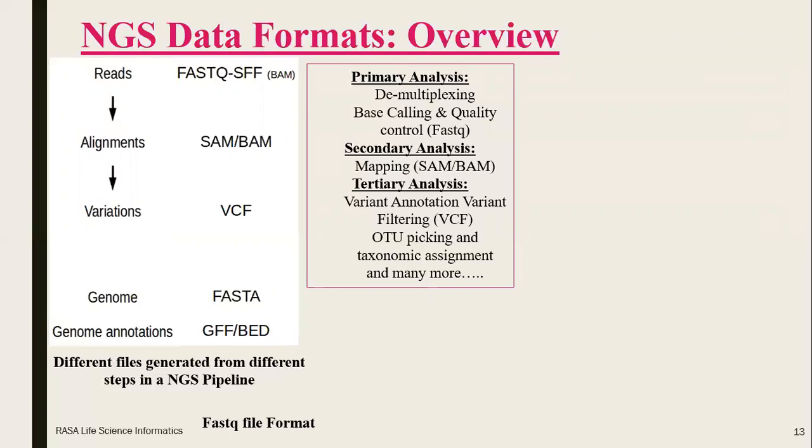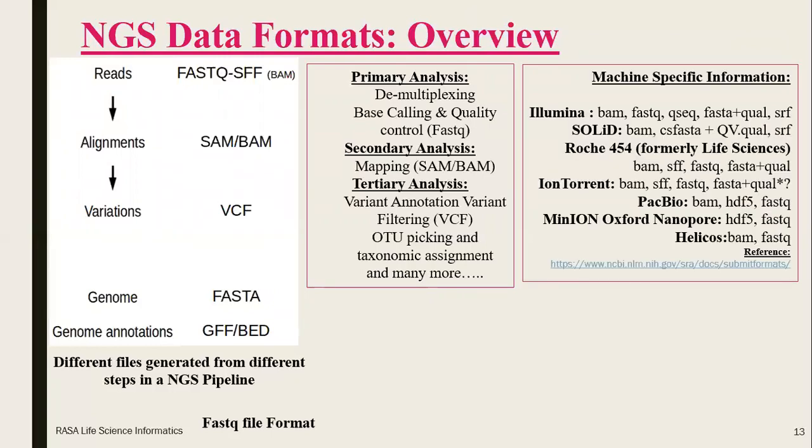Now, as we can see in the picture, for pre-processing of reads for amplicon analysis, the raw files generated from the sequencing platform are subjected to demultiplexing, adapter trimming or quality filtration. In demultiplexing, the reads are assigned to their sample of origin based on the sequence of their corresponding molecular barcode.